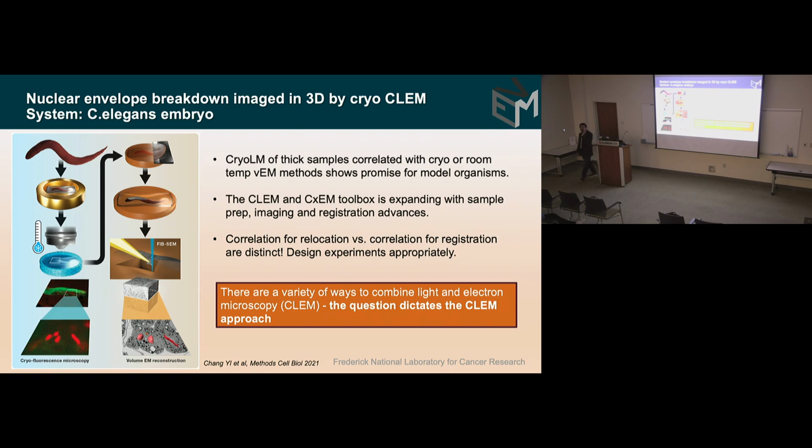Yep. Actually, it's a follow-up to your question. You said you also did a TEM in that workflow? Yes. Not of the exact same. So in a spermatocyst, this was at the 16 cell stage, and the great advantage of FIB, as you know, is that you can have extremely targeted imaging. Because they're very well synchronized, we targeted for FIB-SEM a pair that was on the bottom right at about 4 o'clock.